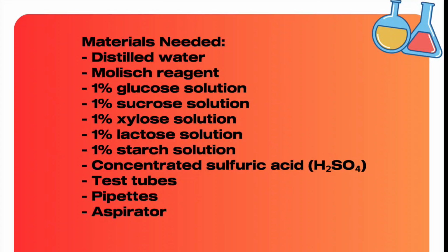The materials needed in the Molisch test: distilled water, Molisch reagent, 1% glucose, sucrose, xylose, lactose, and starch solution, concentrated sulfuric acid, test tubes, and pipettes, and also an aspirator.